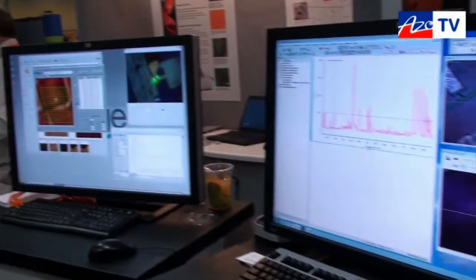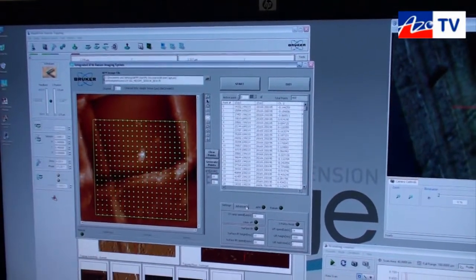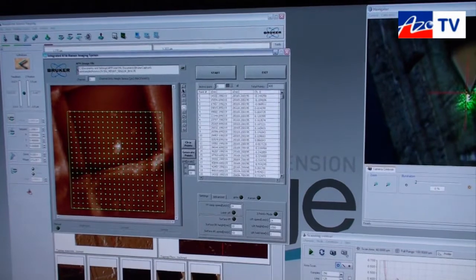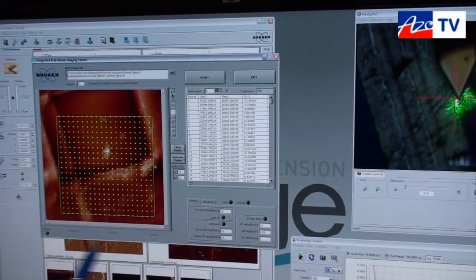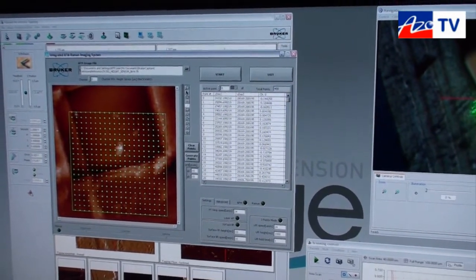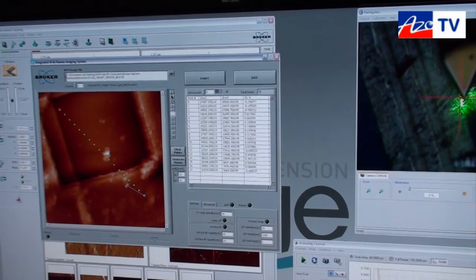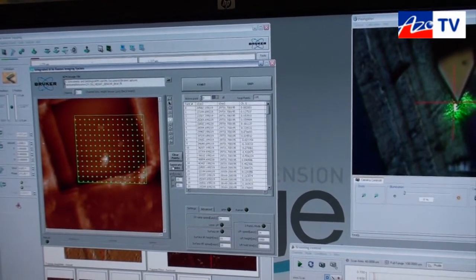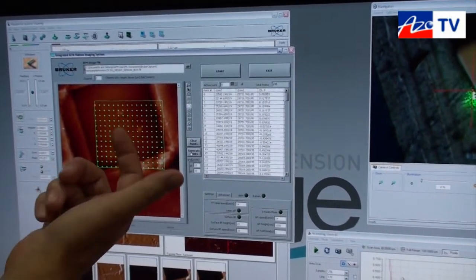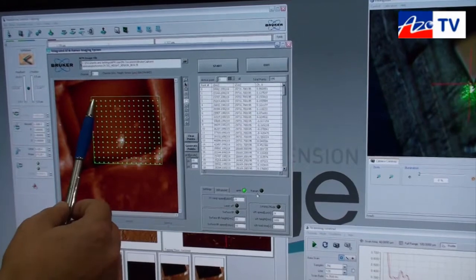On the software side, we have our IRIS software here which runs parallel to our standard AFM software. The software allows us to take an AFM image that we just recently acquired — we can see here a topographic AFM image — and we can overlay a series of points either in the form of a line, a rectangle, or various other shapes over that image, generating a number of sampling points where we want to generate Raman spectra, and then transmit these to the Raman microscope to take a spectrum at each of these points.